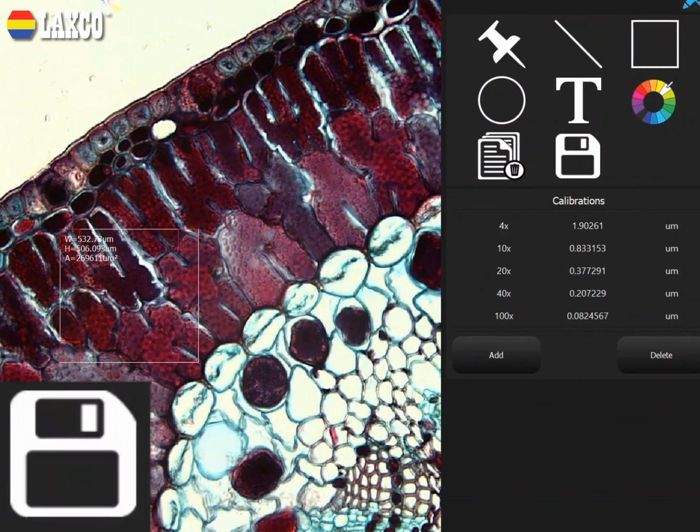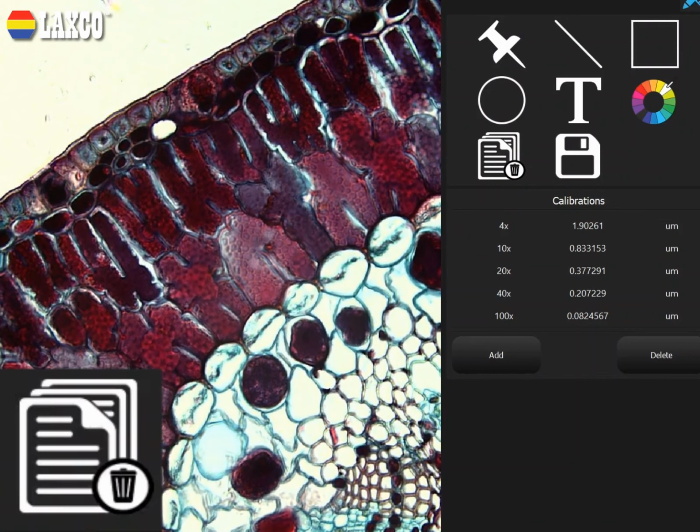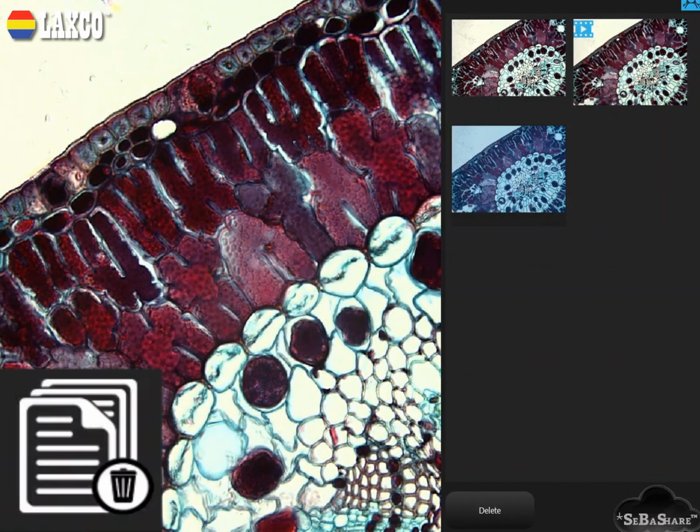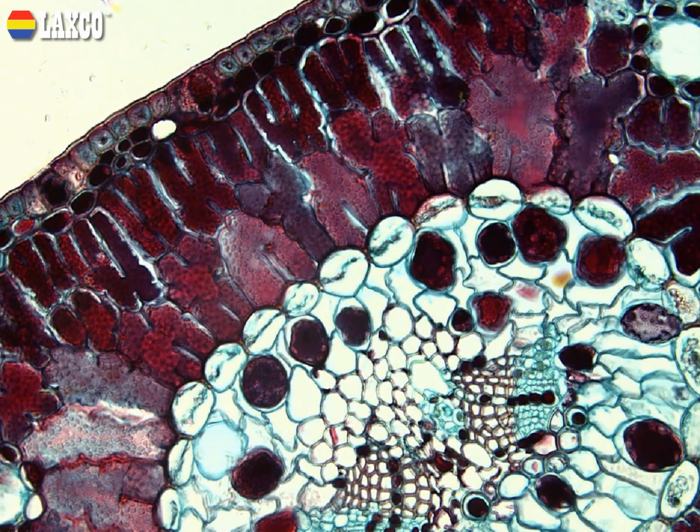You hit the save button here to save your image and your image is automatically saved. You can again go and find it under the gallery. If you want to lose the square from the live image, you just hit the cancel button here and you just hide this away and then there it is. As you can see that it stored that image under the gallery. So again, if you double click on it, the image would again pop back up. That's pretty much it. It's a very user-friendly software and it's very easy to use.